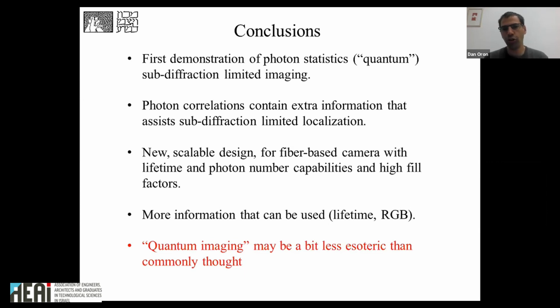In fact, we don't use beam splitters at all. Beam splitters are here just to demonstrate the effect, how the effect is measured. In practice, our beam splitter is just diffraction. We sample our image with a detector that is single photon sensitive, but such that many detectors, maybe 5 to 15 detectors, sample a single diffraction limited spot. And so we use diffraction as a beam splitter. So there's actually no beam splitters used in this setup.